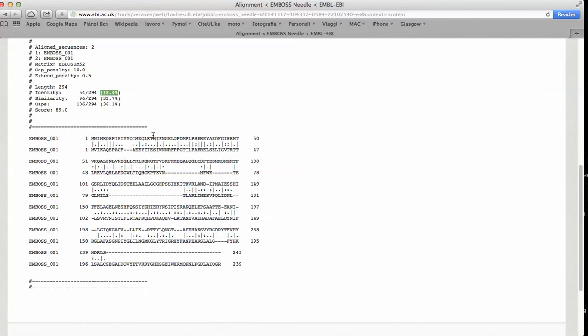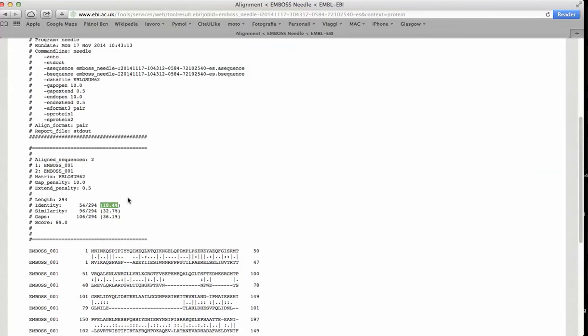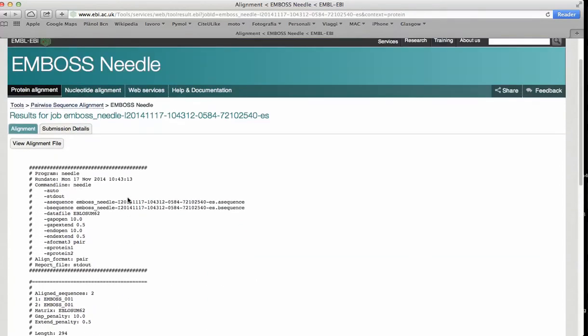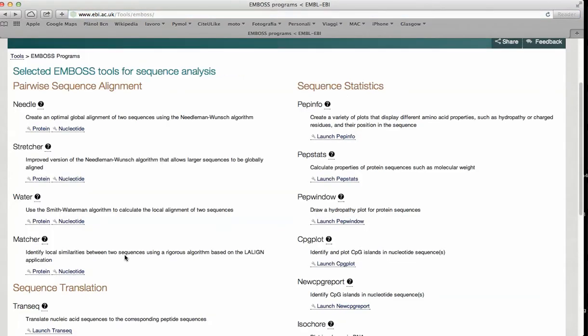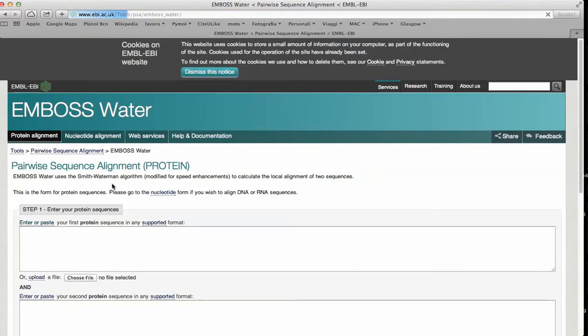So we have to be very careful in order to make a statement about the evolution of their relationship between these two sequences with these low values of identity. So let's go to explore on a local basis these two sequences.